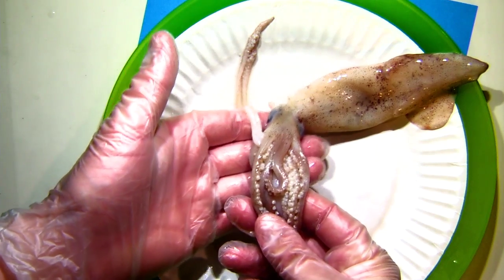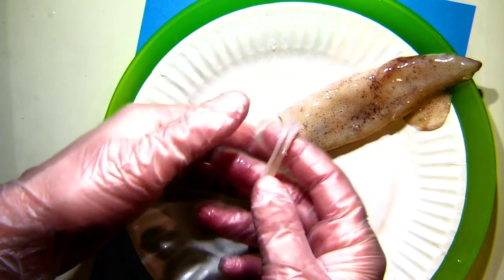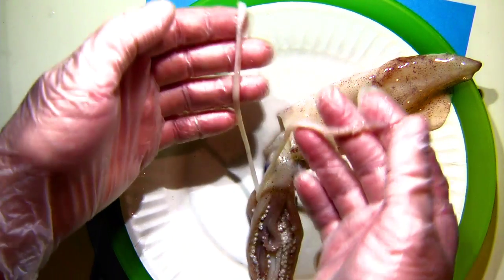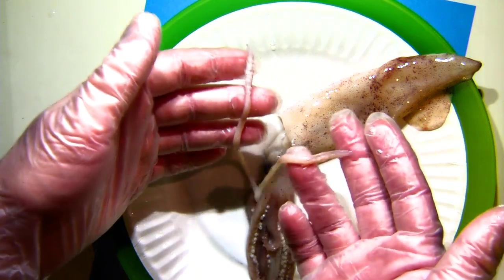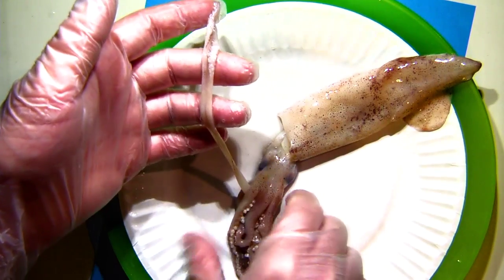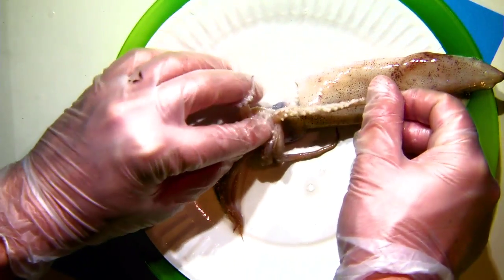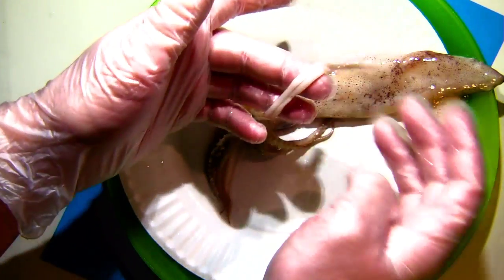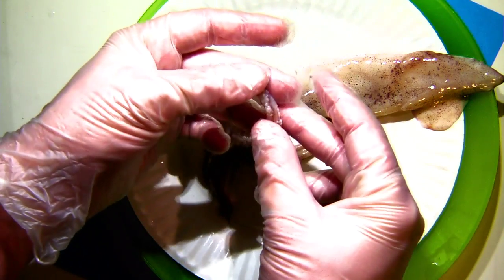But you'll notice I'm skipping something. There are these two other long things coming up to the side. These are the extra appendages that squid and cuttlefish have that octopus lack. These are called tentacles. People often use the terms arms and tentacles interchangeably when talking about these animals, but technically the arms and tentacles are two different structures. The arms have suction cups along the entire structure, all the way from the base to the very tip.